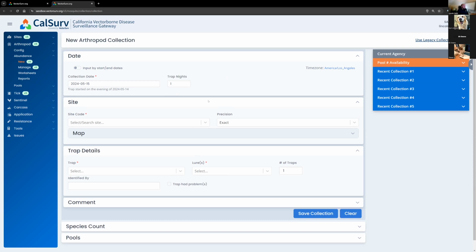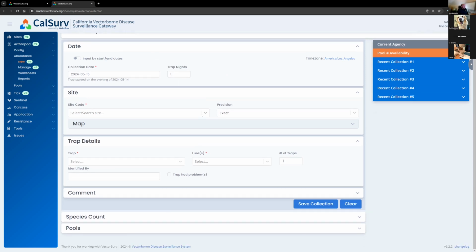Okay. The next set of information that would be entered would be the site where the collection occurred. So this is what Kurt was talking about in the previous trainings.